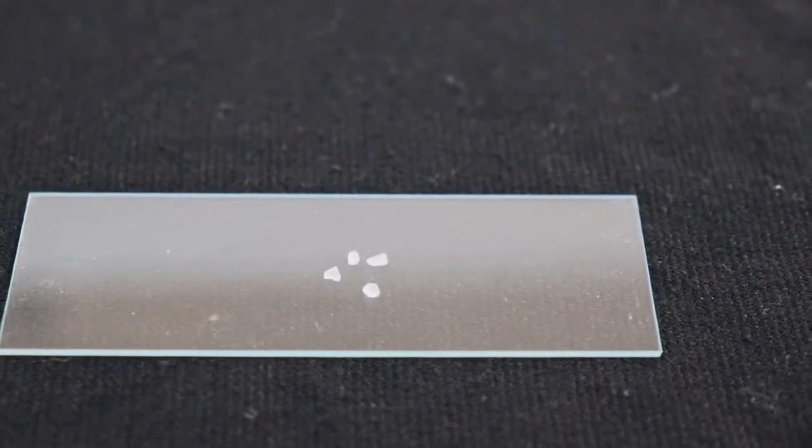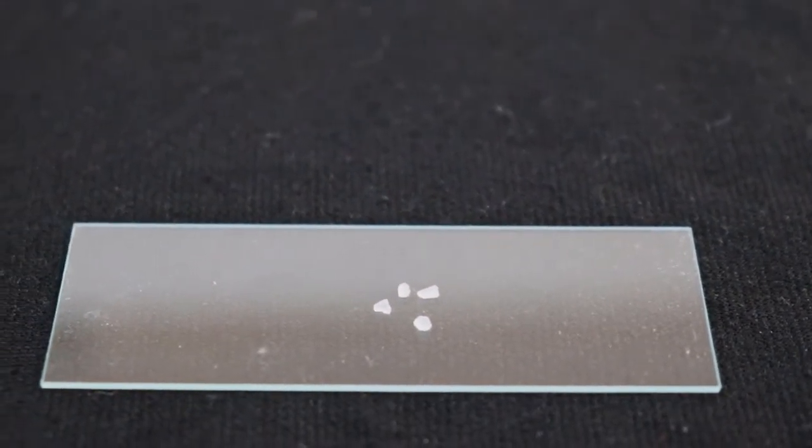Okay, this is sea salt. It's bigger than regular salt, so let's see this under the microscope.